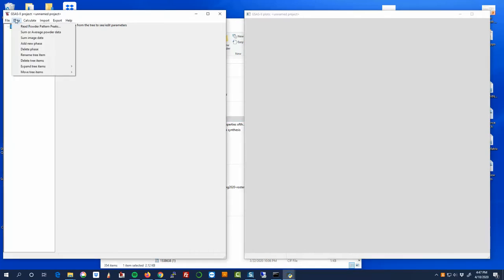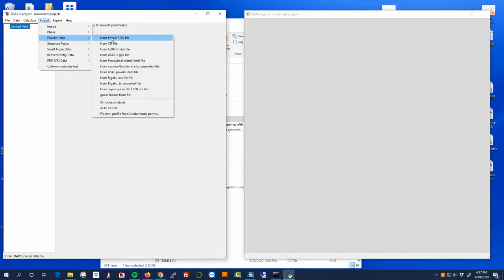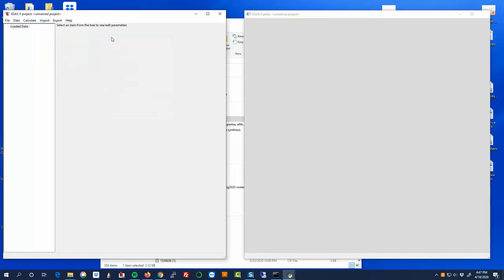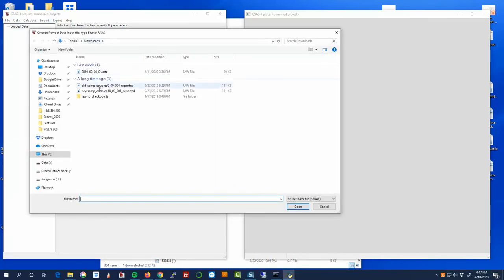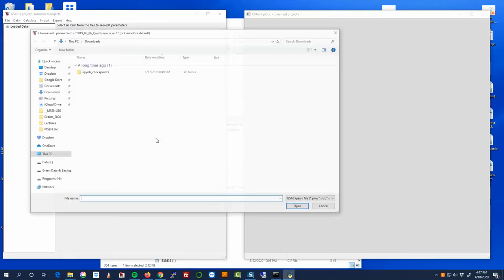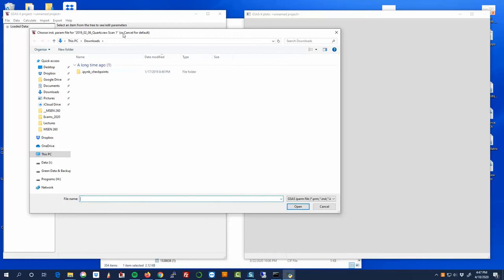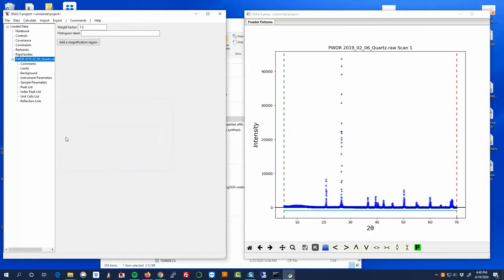So the first thing we need to do is go ahead and bring in our data. And so we can import powder data. In this case, we're coming from a .raw data format. And I just am browsing to where I had downloaded it. It might be a different location for you. And it's going to ask for an instrument parameter file. And so that's basically a bunch of information about the diffractometer. And we're going to assume that we don't know that for now. And so I'm going to say cancel and use the defaults for the copper K-alpha lab data.